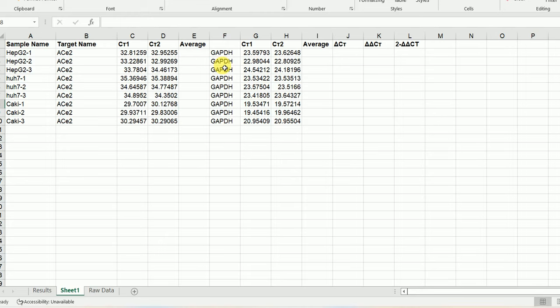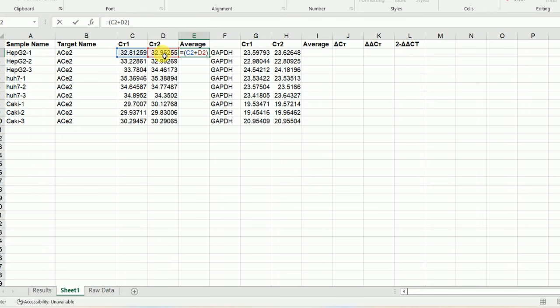These two values are the technical replicates. We have to use the formula to calculate the average. We will simply calculate the average for these two values. To calculate the average, I'm going to select this value plus this value and divide it by two. This is my average and I'm just going to drag it down to the end.